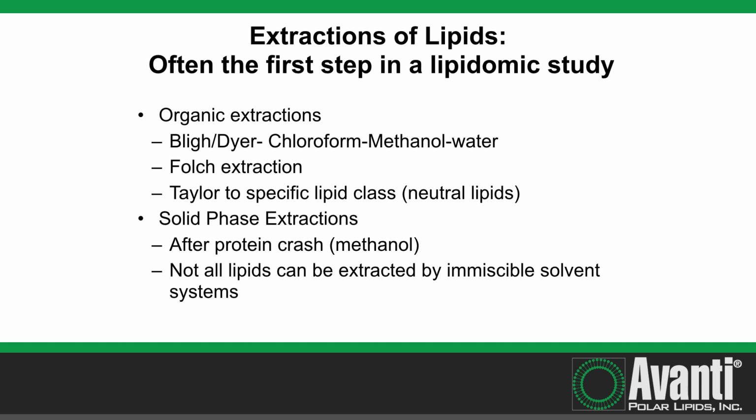The other type of extractions which are out there for lipids are solid phase extractions. The commercial term like Sep-Paks, which are used extensively to isolate lipids based upon the hydrophobic character or the lipophilic character of lipids compared to other biomolecules which are not retained by these substrates.